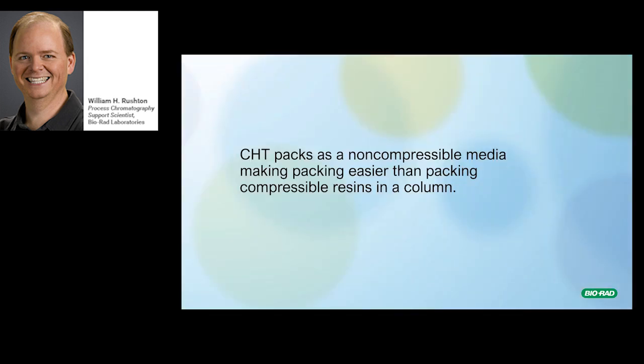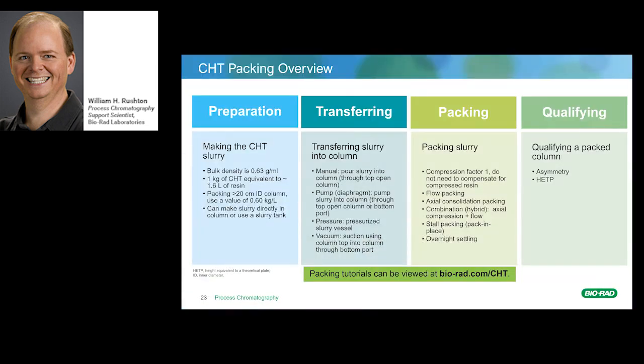I'm now going to move on to speaking about CHT packing. It packs as a non-compressible resin, which makes packing easier than packing compressible resins in a column. Here's an overview on packing CHT.